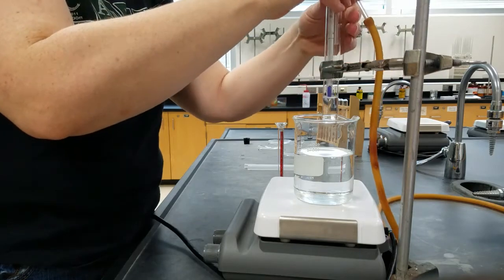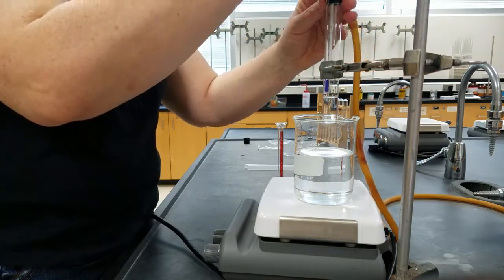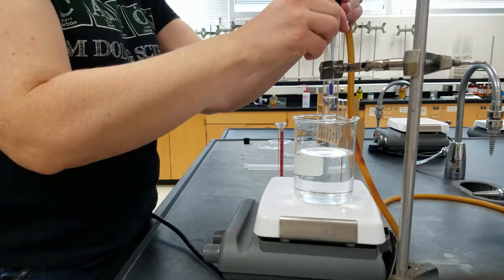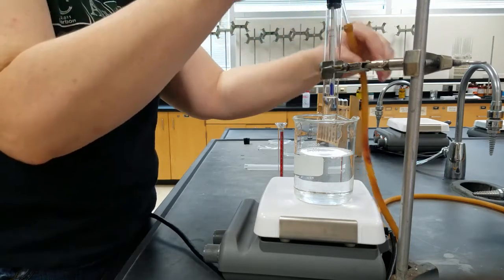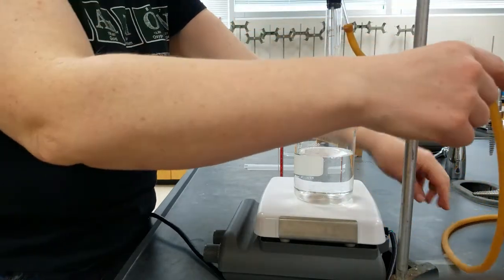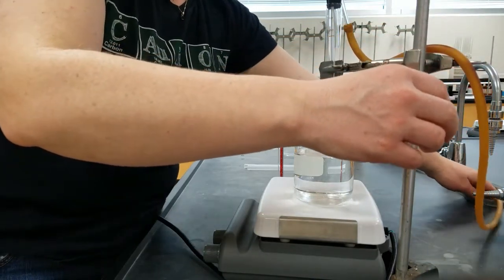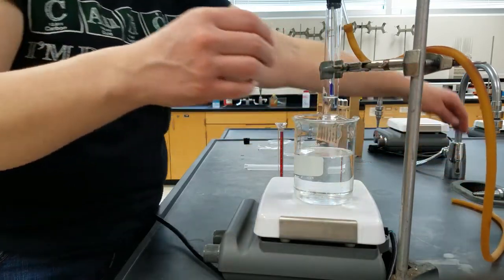We want to add the thermometer into the test tube so that the bulb is just a little bit above the liquid level. And that way we are determining the temperature of the vapor of the liquid.